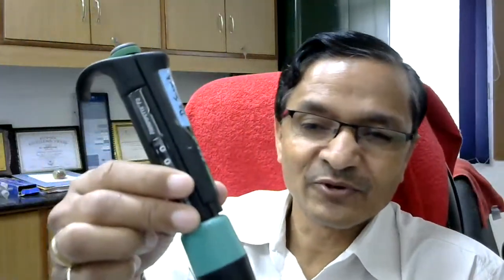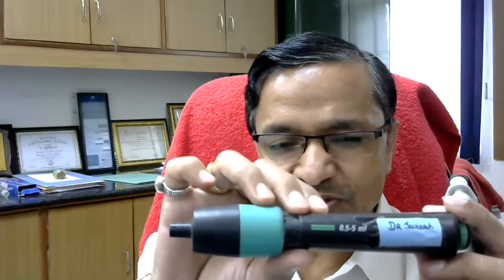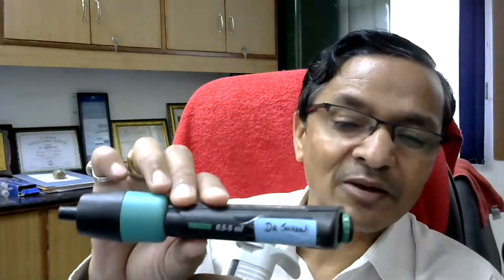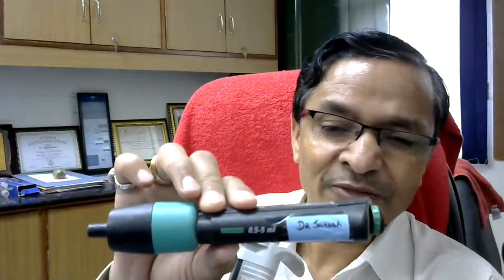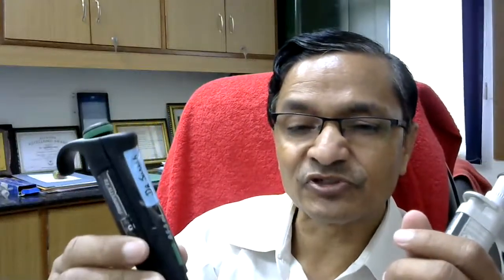Say for example, another pipette. Here you can see again what this pipette is. It is 0.5 to 5 ml. So first you have to see the capacity of this pipette.